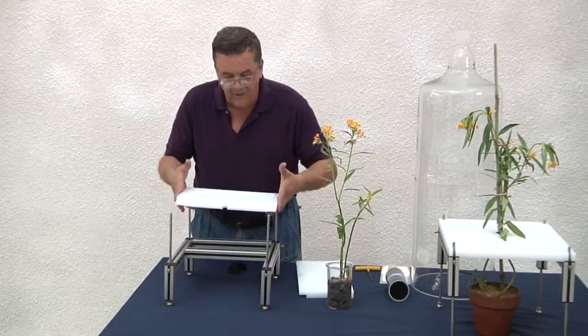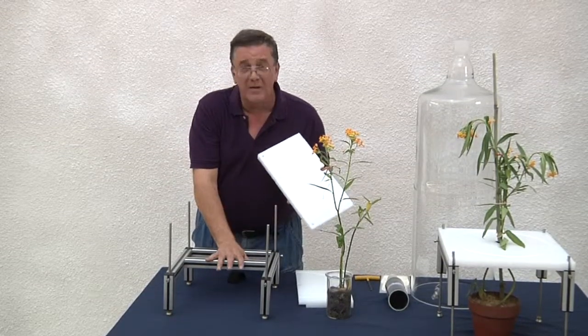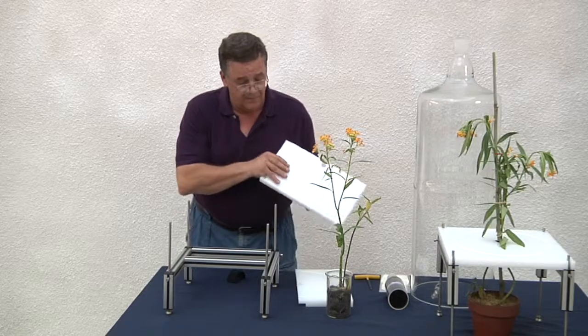You will also notice that on the bottom half of our guillotine plate we have grooves cut out that form into the stand so it locks into place.